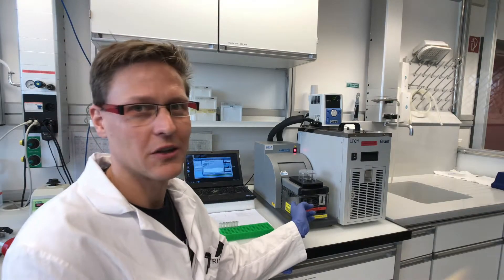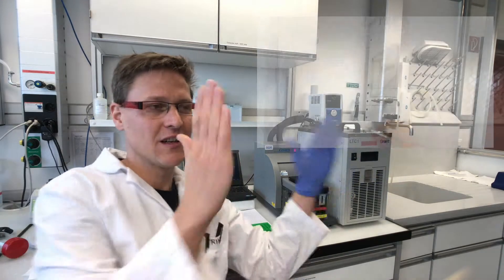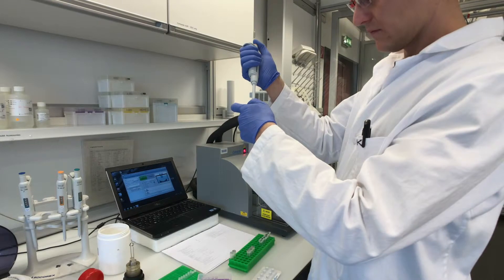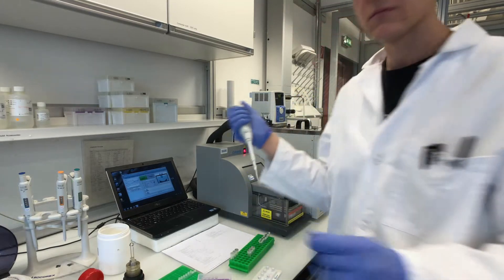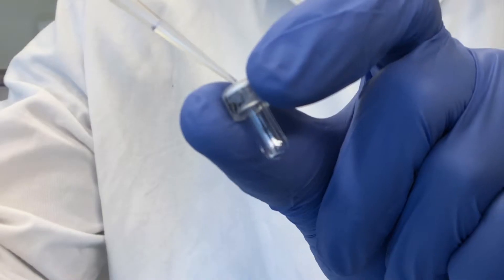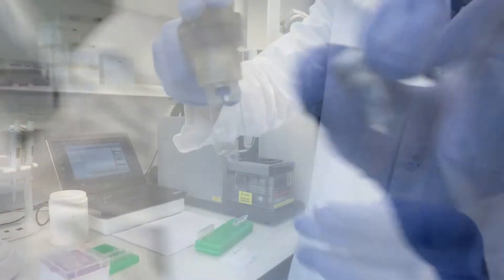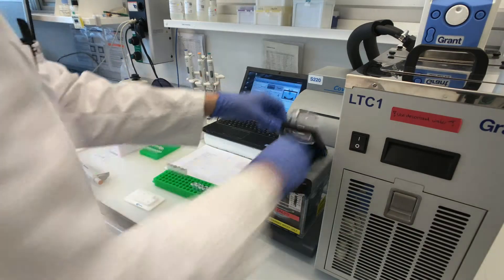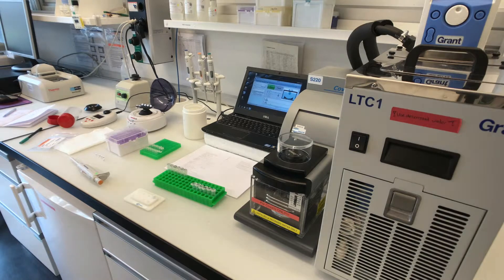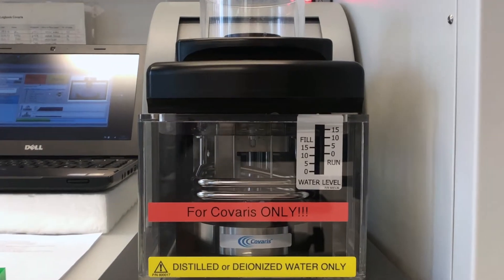This thing is called a sonicator and it fragments the DNA. Basically it splits up this long text into smaller sections which we can then read. The ultrasound generates a lot of heat in the small DNA sample. That's why this tiny tube sits in a big pool of cold water.